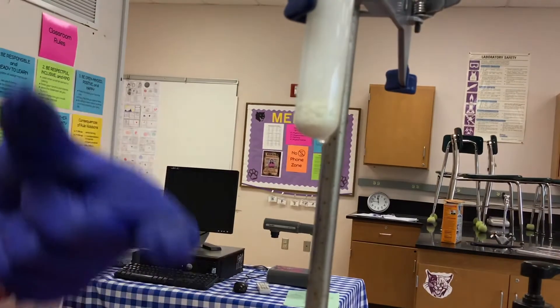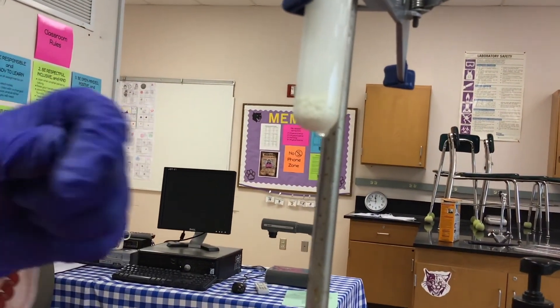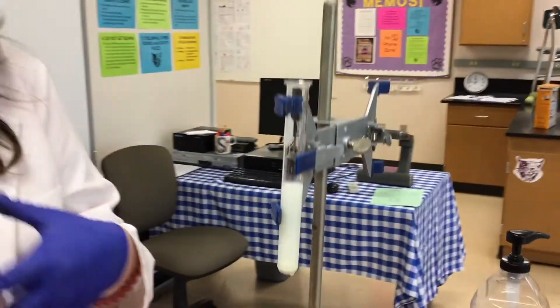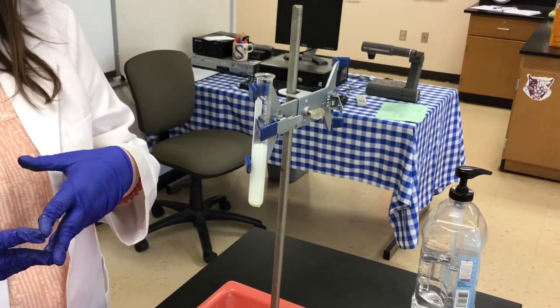That solid that forms is called a precipitate. Some double replacement reactions will form precipitates, which are essentially just ionic compounds that form a solid in our reaction.